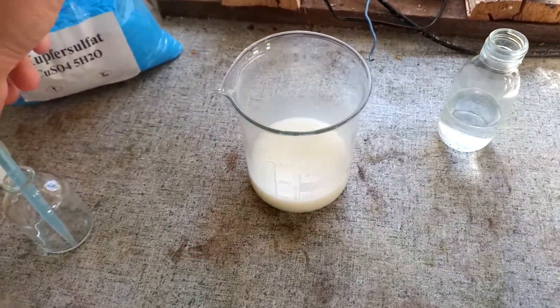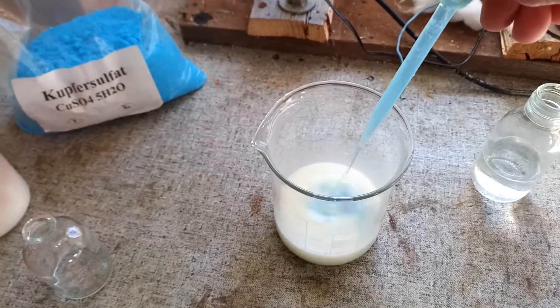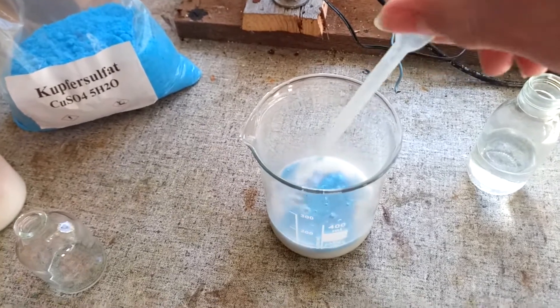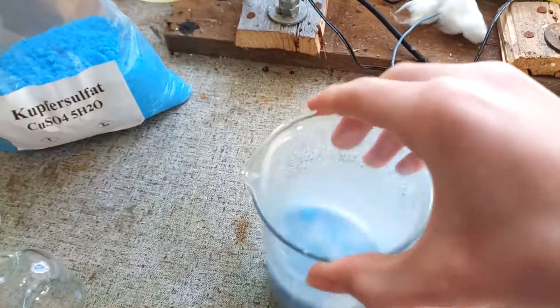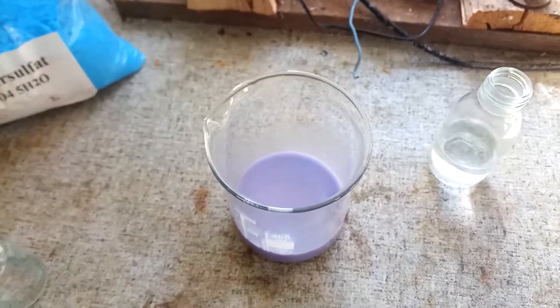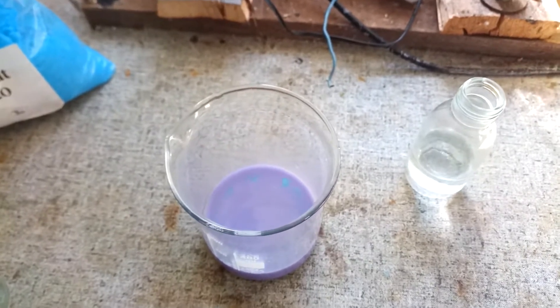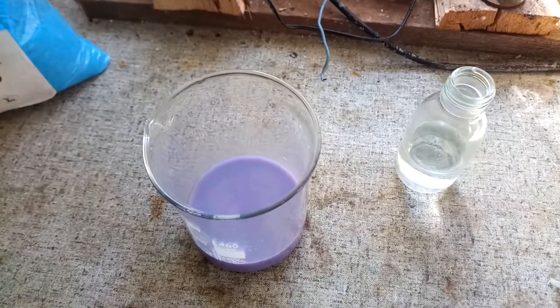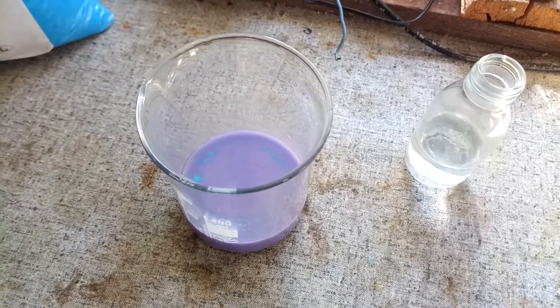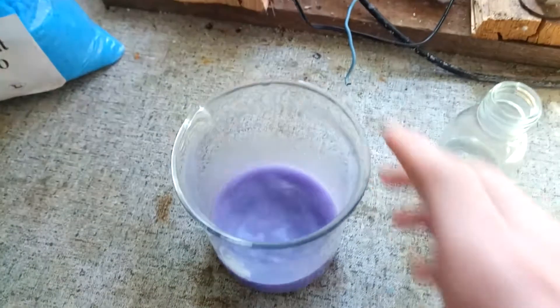And then you just add some copper sulphate solution to it and get in there. And it will change colour to this very nice purple, and that's a positive result. That means that you have proteins in solution, which shouldn't come as a surprise with milk. So yeah, that test works pretty well.